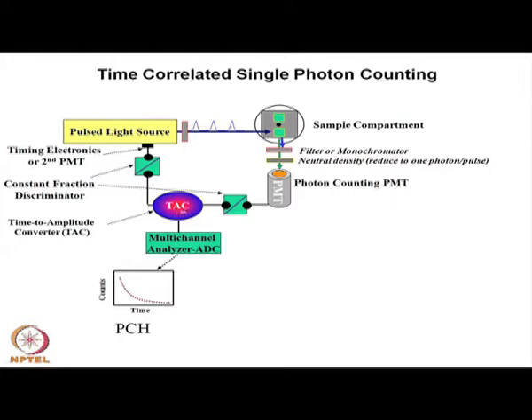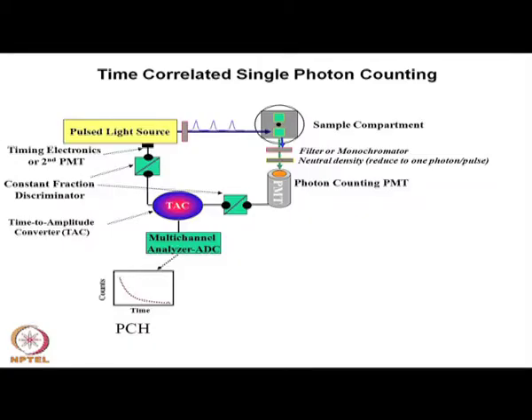What is happening now is that this start signal is given to the TAC so that it is turned on, and the stop signal is given to the TAC to turn it off. The TAC has a switched current source charging a capacitor. So, it is a capacitor charging mechanism, measuring the time required to charge a capacitor to some value. The principle works with remarkable accuracy, and a few picoseconds can be resolved by this charging mechanism.